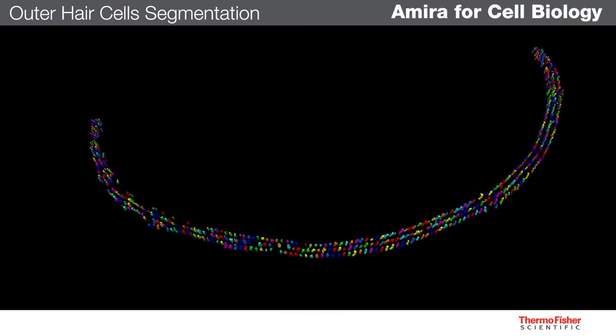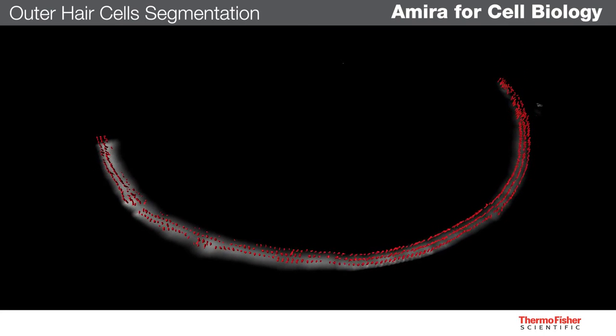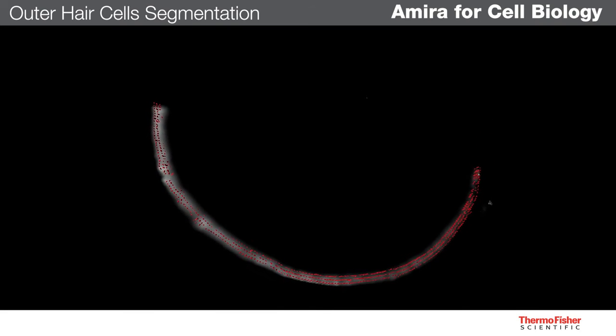The same measurements that were applied to the inner hair cells can then be applied to each individual outer hair cell. The result is a complete segmentation of all outer hair cells using the red channel.